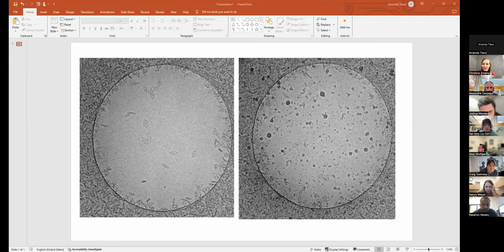And then over time, you can see on the right what happens as I'm imaging. I'm not really sure. It kind of looks like ethane contamination to me, but obviously it's over the particles, and it's really making it difficult to get good structures for reconstruction.